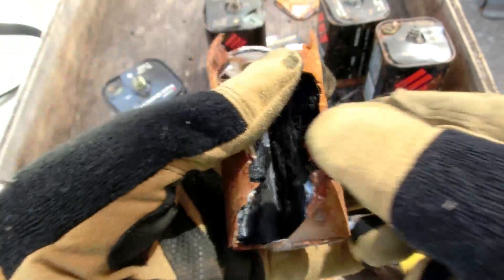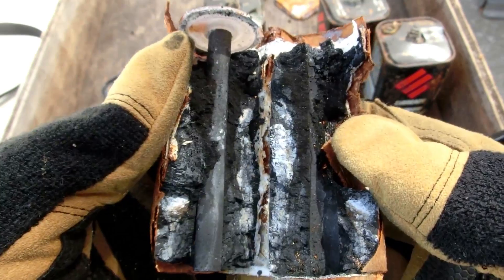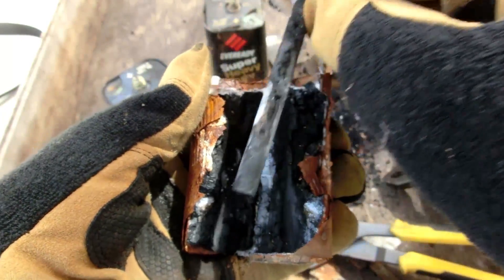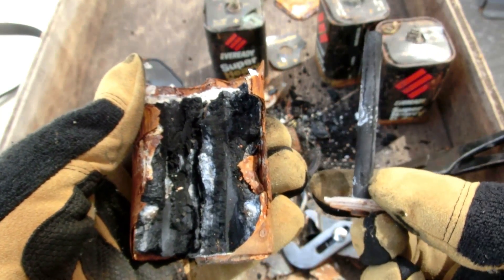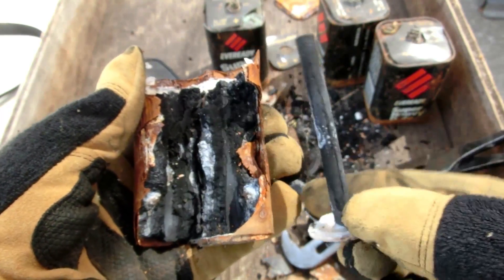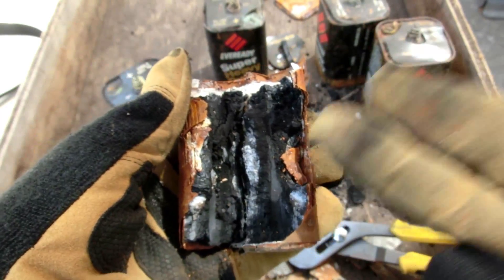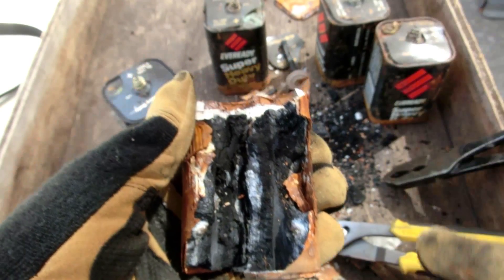So here's the inside of one of the cells. This represents a 1.5 volt cell, similar to like a double-A battery but just bigger. We have the graphite electrode in the middle, which does not get dissolved when the battery gets old, so you can still get these out of old batteries. And if you're going to buy a battery to get the graphite electrode, you might as well use the battery up before you rip it out for the electrode.